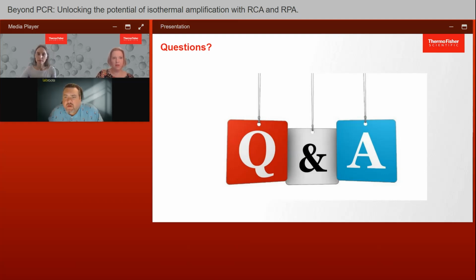All right. The next one here, Raminta. For MDA, when handling small volume samples, is nucleic acid isolation required before amplification? So in the standard MDA workflow, it is not required to isolate nucleic acids before amplification, especially when you are using cells that are easily lysed. And this lysis step is fully sufficient for amplification.